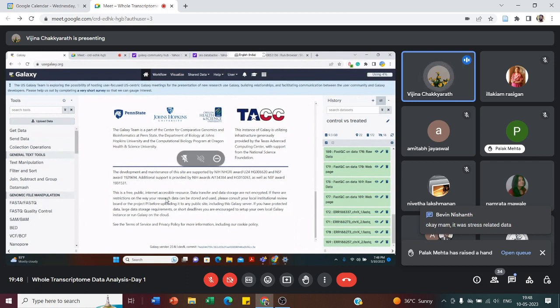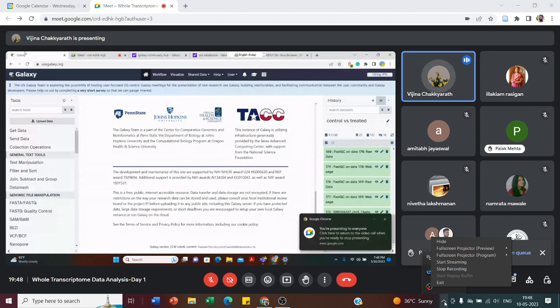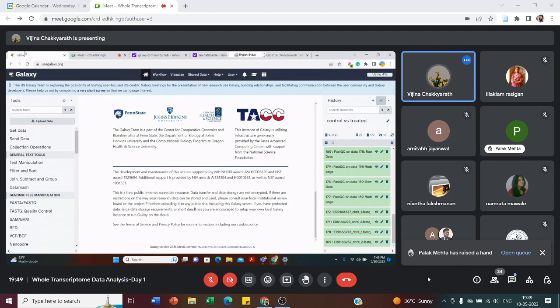If you are getting confused about paired end and single end, I can describe that also. In single end sequencing, only one end of the DNA fragment is sequenced. This means that the sequencing instrument reads only one sequence from each DNA fragment. Single end sequencing is useful for applications that require lower sequence depth or shorter read length.